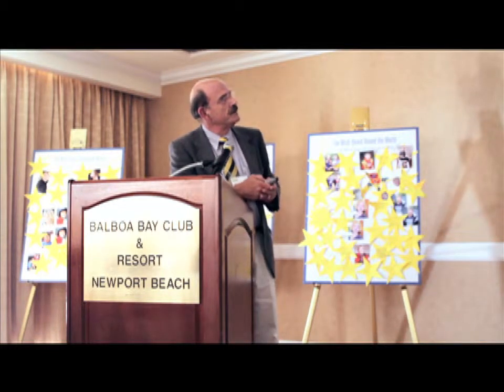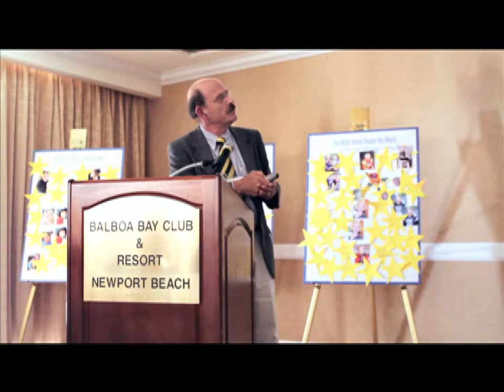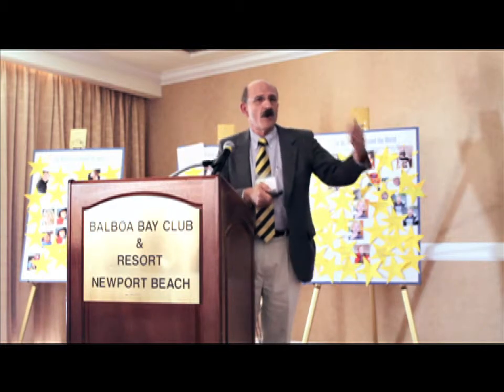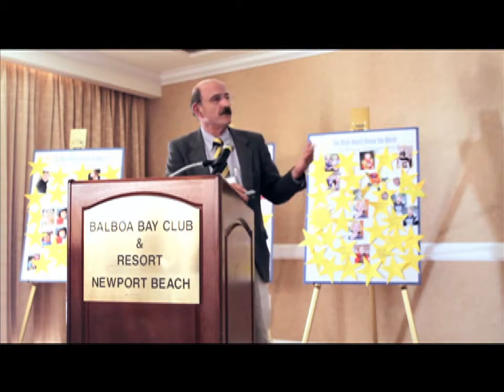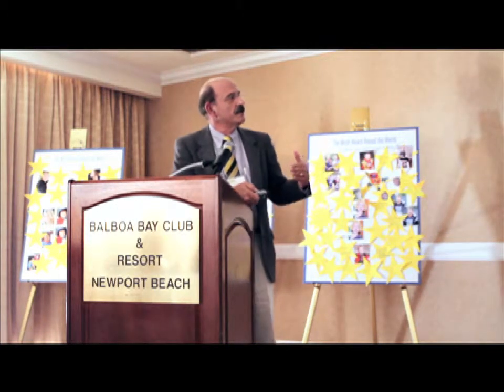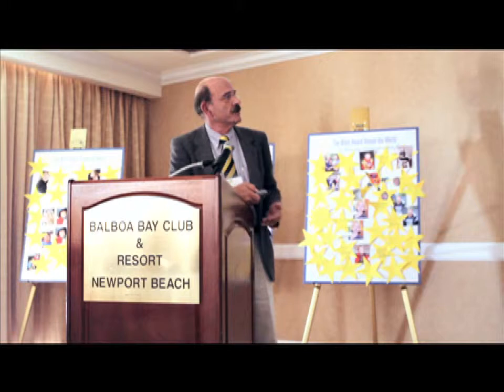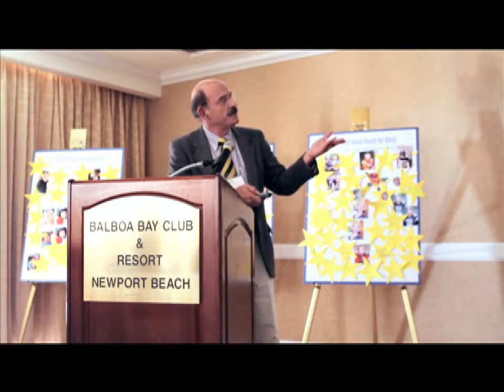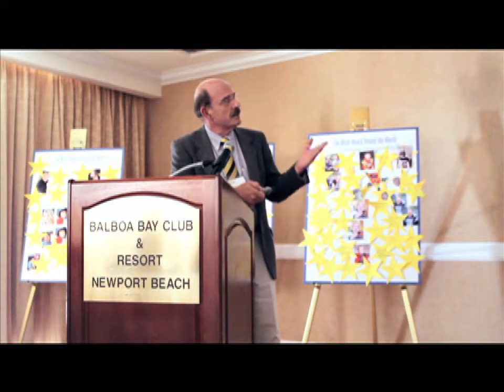This is just to show that these cells that migrate in with this very bright green actin staining are actually inflammatory cells. This is a marker, CD45, for acute inflammatory cells. And you can see it lights up very nicely with these cells that are infiltrating at these different ages. So part of the process of this disease then is damage to these very important keratocytes, cell death, migration of inflammatory cells in, and this can ultimately lead to neovascularization and scarring, which occurs in the mouse around 7 days. The same kinds of changes are also occurring in the endothelial cells, as you can see there.